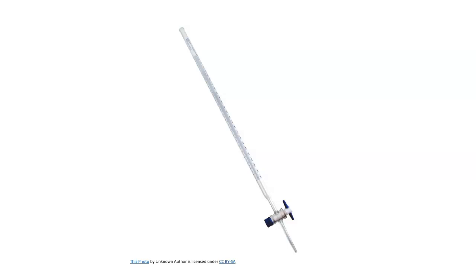So then once you're done, basically, you're going to have to fill the burette. You're going to close the stopcock and use a clean funnel. You'll probably find one in your tray or your drawer.